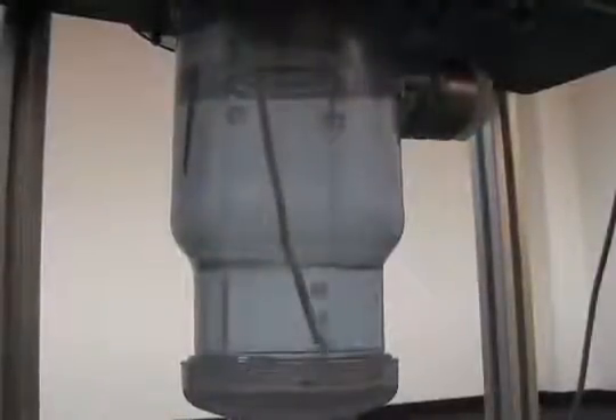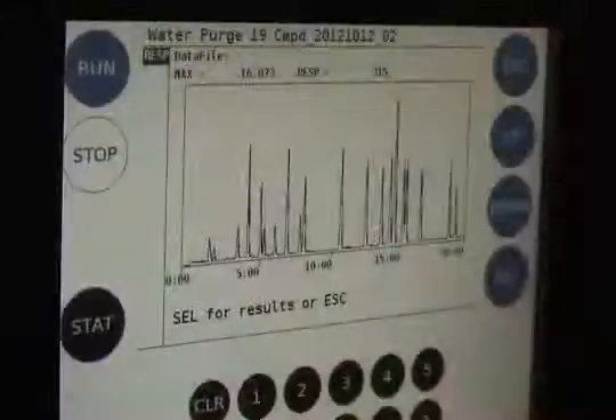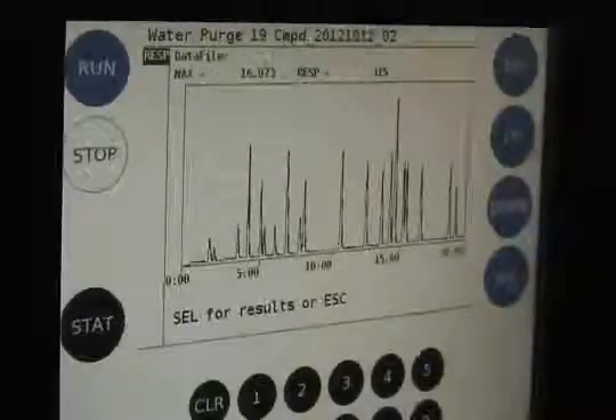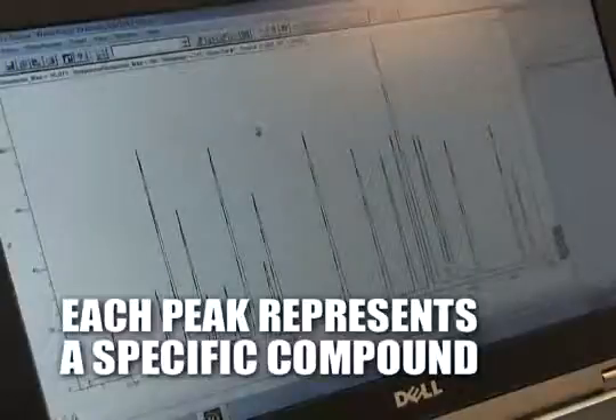Argon carrier gas will flow through the water purge tube and the bubbles produced will ascend into the headspace. The collected compounds from the headspace will be drawn into the sample pathway and become trapped onto the internal tri-bed concentrator, and then desorbed onto the 30-meter GC column. The water purge method takes approximately 20 minutes to complete. All 19 peaks are displayed on both the front panel and laptop. The analytes are separated based on boiling point, and each peak represents a specific compound.